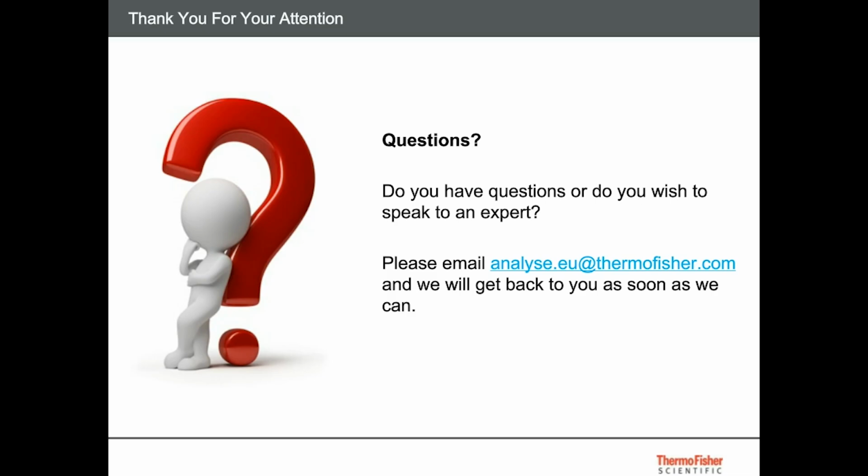Okay, what are the sample volume requirements for the system? So I can take this one. The sample volume required for the system is there is a minimum of 10 microliters just to feed the autosampler then into the seed device in the microchip well. But typically, majority of these can be recovered because only between 1 and 5 nanoliter are consumed during the analysis itself.